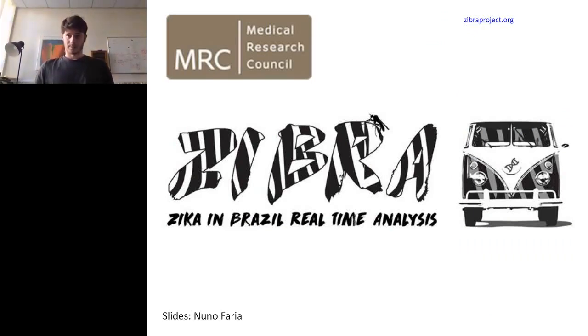So I'm going to have to increase in speed because I've only talked about Ebola so far, and I've still got quite a lot to talk about in Zika. So we had a grant that was funded by the Medical Research Council as a rapid response grant to use what we'd learned about doing mobile genome sequencing for tackling Ebola for doing Zika.